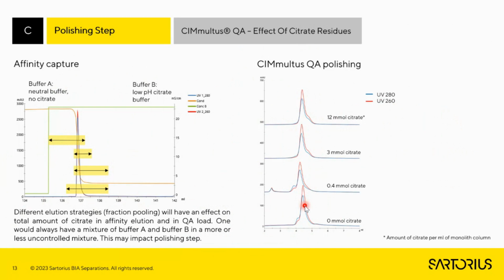So this really, again, plays an importance if you want to do your QA in a stepwise gradient, when you have fixed conditions for the elution and you don't rely on a linear gradient as shown here. You might then be collecting a different fraction than you assume, and you tested it on your PD scale using a linear gradient.